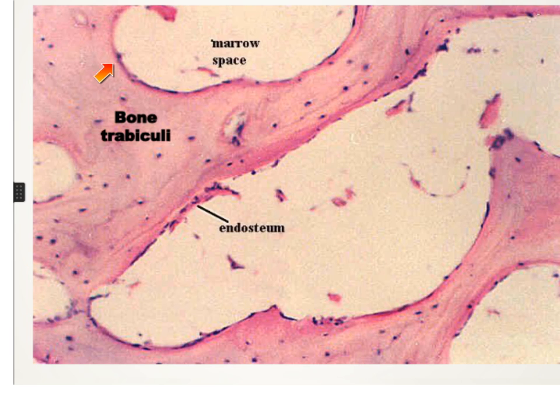Here we have the bony trabeculae, which is formed of the acidophilic bone matrix, and we have these imprisoned cells, which are the osteocytes. So this is the endosteum, very thin layer, which is rich in osteogenic cells and osteoblast. Here we have the bony trabeculae containing the matrix as well as the imprisoned osteocytes.